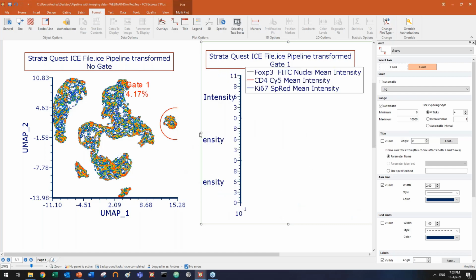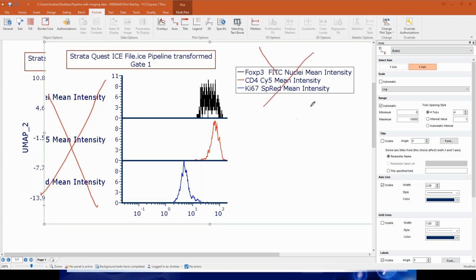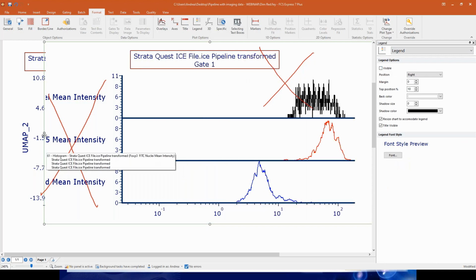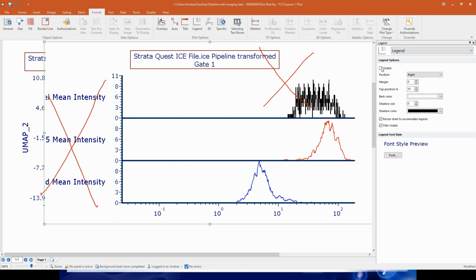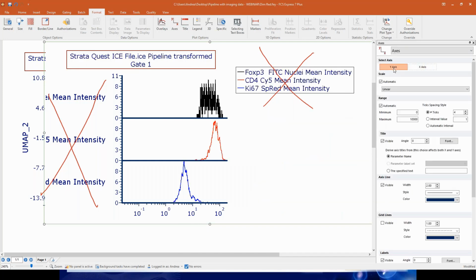And here we go. When you see something like this, it's because the legend is too big. So I usually either remove the legend or the y-axis parameter. It's up to you. If you want to remove the legend, just go to the legend and make it invisible. That's fine. If you want to do the opposite, I will go to the y-axis and I will remove the title.